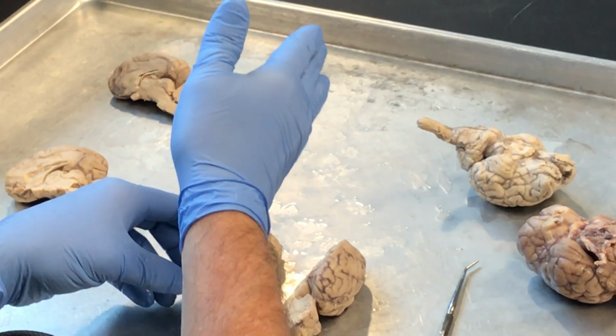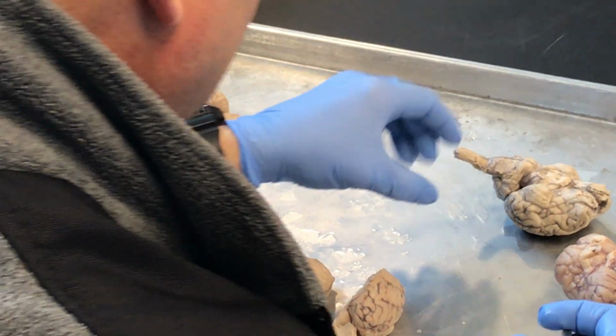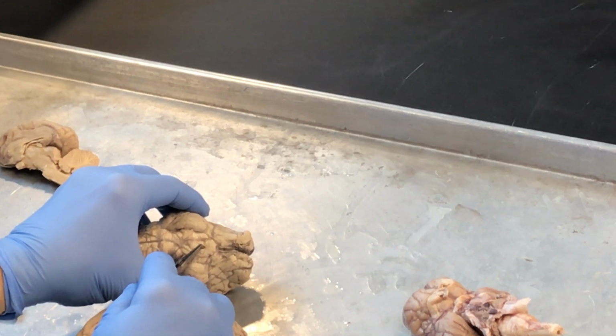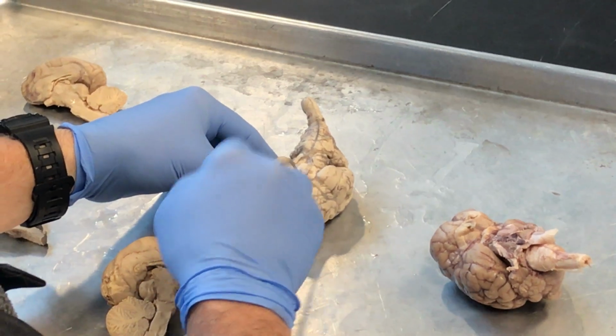So when we cut with the little brain knife, we cut them in half, we fold that open, there's no longer a little space in there. I'll show you where that third ventricle is supposed to be. See where this little hole is? If I put the probe in there, that's where the third ventricle is. There's a little hole there, that's where the third ventricle is down in that space.